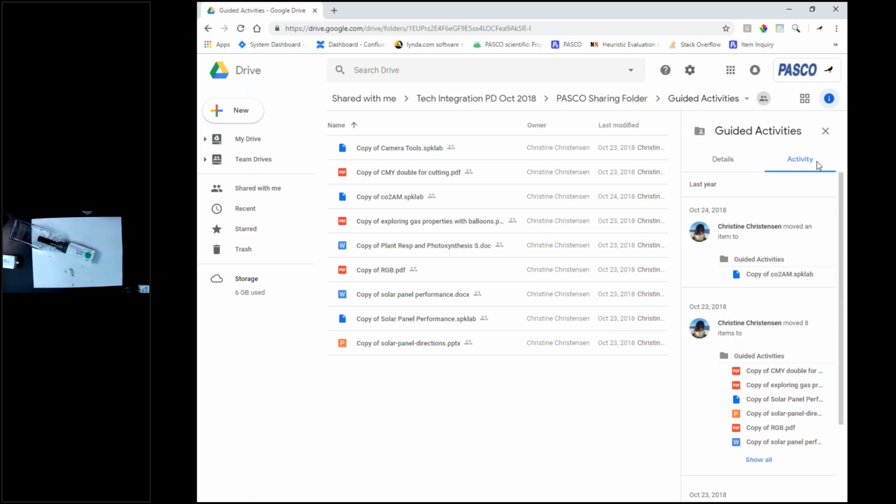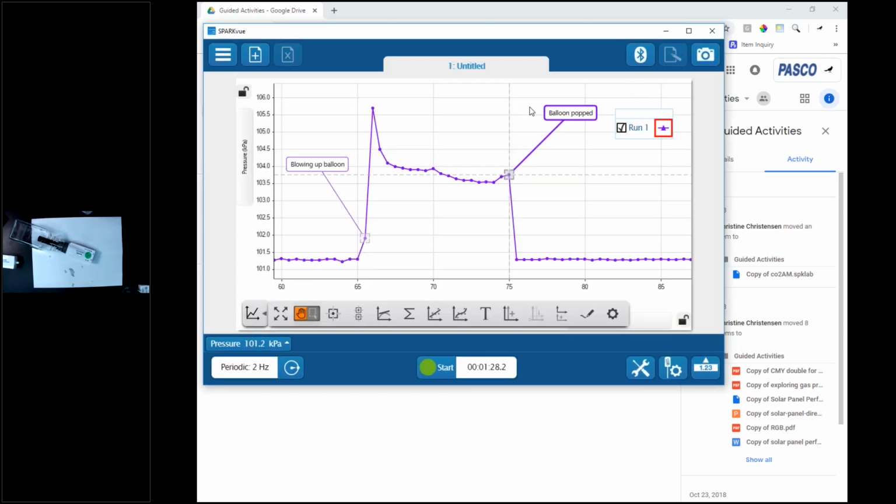And why would you need to calibrate the sensor? Well, the first time you use it, you might want to calibrate it. Honestly, usually when you're doing experiments with middle school students, you're really just looking for changes like, did it go up or did it go down? Did it stay the same? How fast did it change? How much did it change? Those are the kinds of questions you ask. So it's up to you whether you want to calibrate the sensor or not. It should show the trend either way.